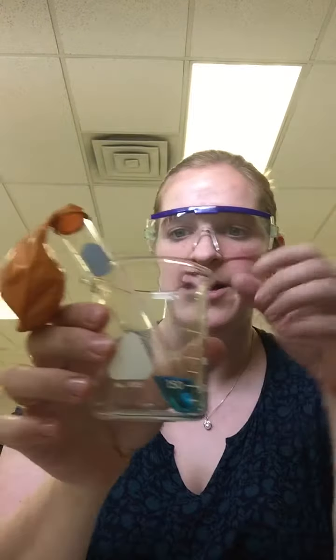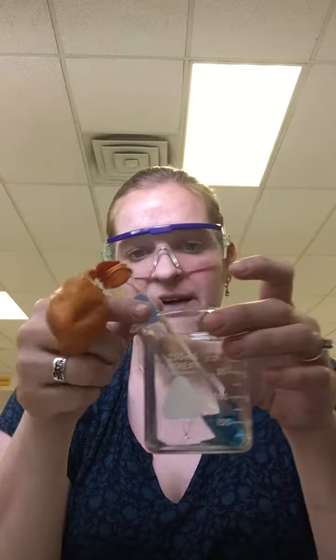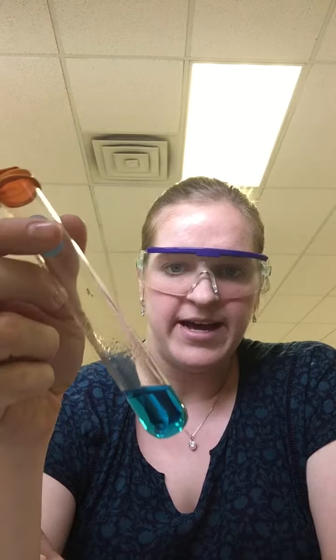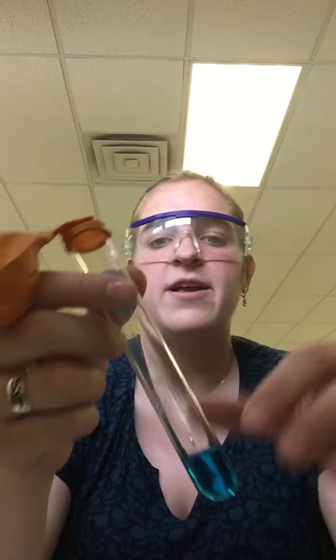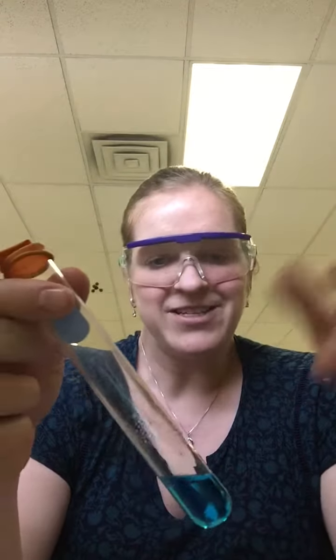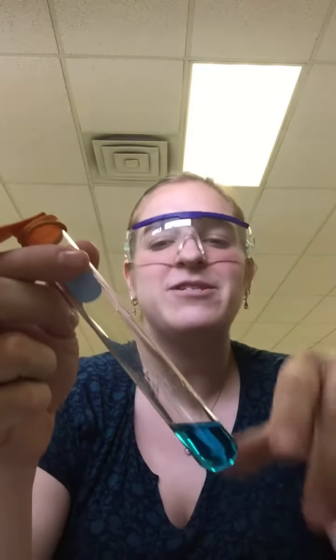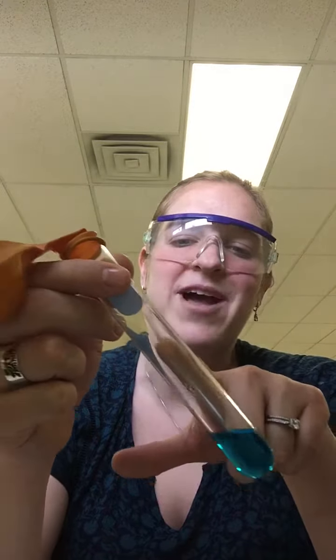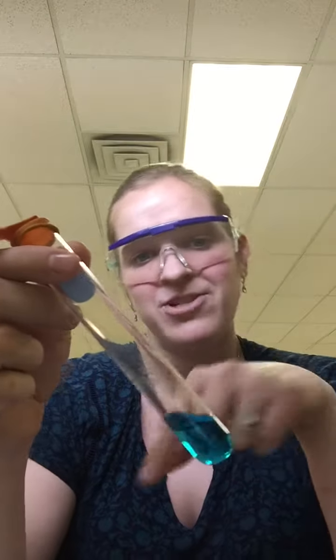So what you are doing right now is taking your part 2. You have your copper and nitric acid, which did its little thing, and now it has a blue substance inside of it. Once you left yesterday, there was a nice brownish red gas in here, and that was your nitrogen dioxide. I wish we had a little more time in class so you could observe it.